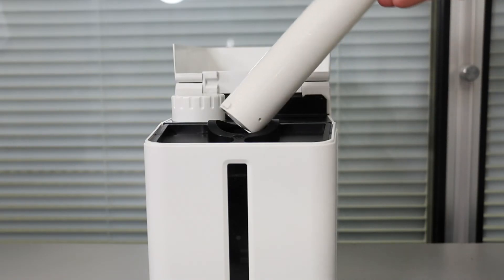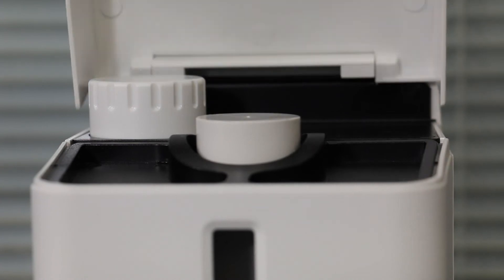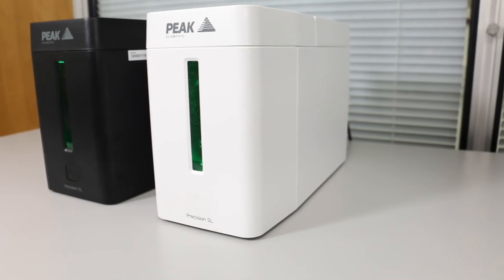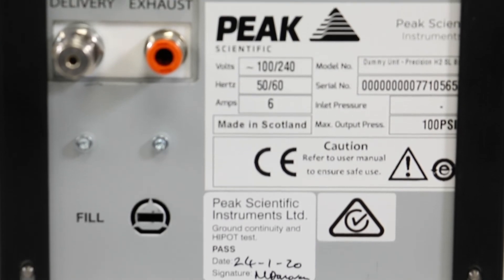Step 5: Remove the deionizer cartridge and replace with a fresh cartridge. Step 6: Fix the replacement deionizer cartridge in place by turning clockwise. Step 7: Close the top panel. The deionizer cartridge will need to be changed after 12 months.